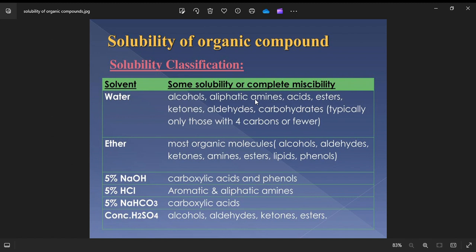So, for your experiment in the laboratory, your sample A was amine. Why is it amine? Because it dissolved in HCl, whereas it did not dissolve in sodium hydroxide, and it is a basic compound. Number 2, your sample B was any of the low molecular weight compounds like aldehyde, ketones, alcohol, esters, and co. Why do you say so?